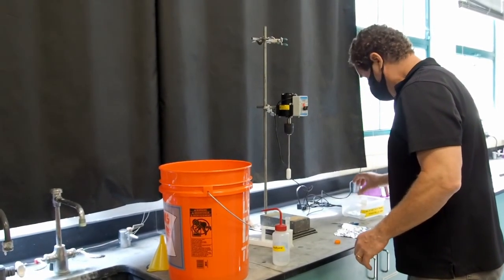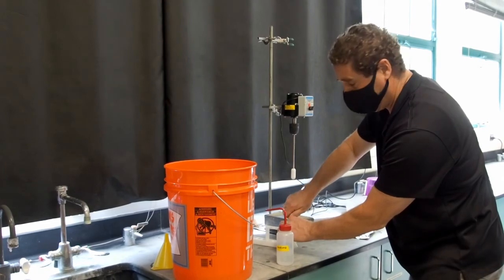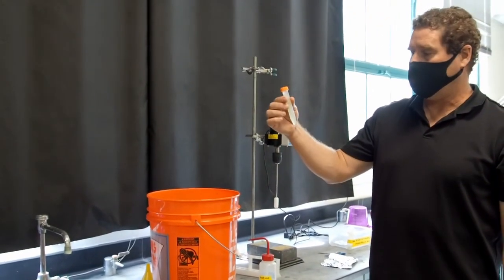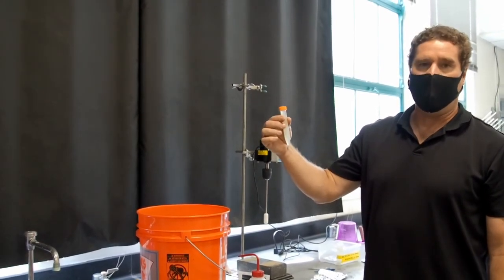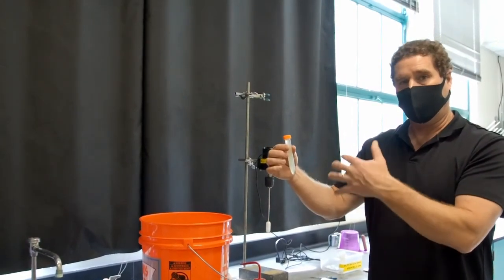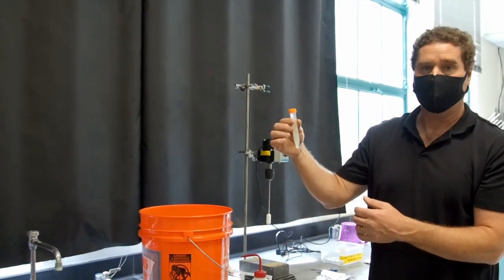And then the centrifuge tube can be stored also frozen in the dark for a period of time before we process this. In fact, one thing we have to do is keep this in the dark, usually in the freezer, for at least 24 hours before we process the sample. That gives the acetone a chance to dissolve away lots of the paper, extract the chlorophyll, and it's going to give us a better result when we go to use this.